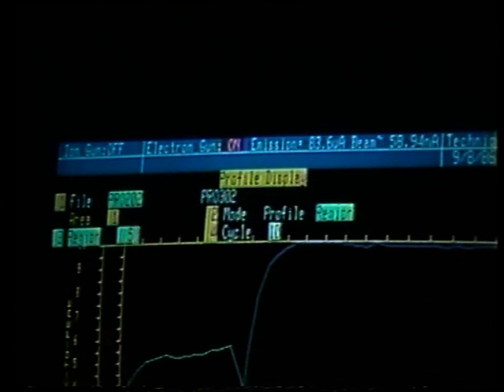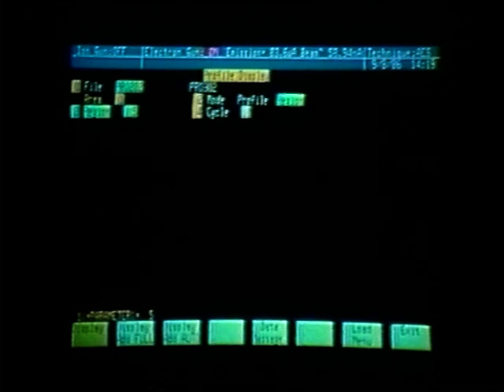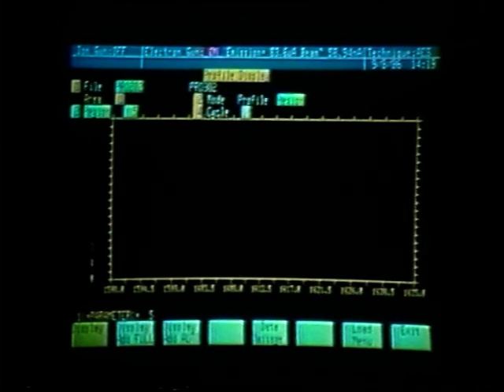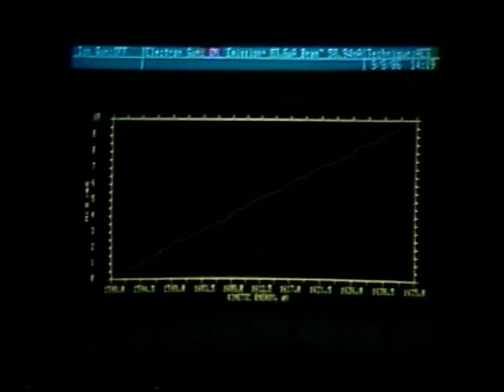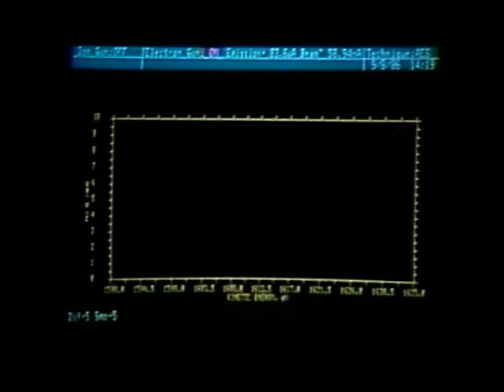To display that, we press soft key number 1. We see the N of E data for silicon. Let's again differentiate that, enter the data massage with soft key number 5, and press soft key number 2 to differentiate 5 and smooth 5.